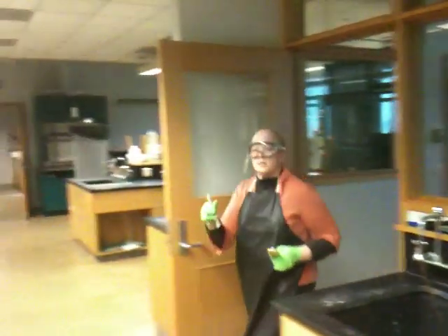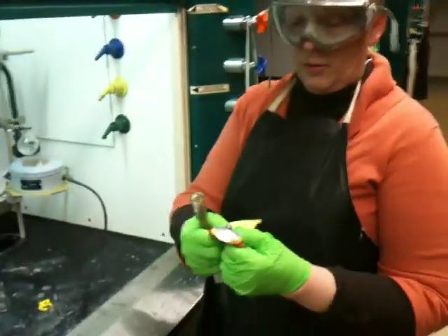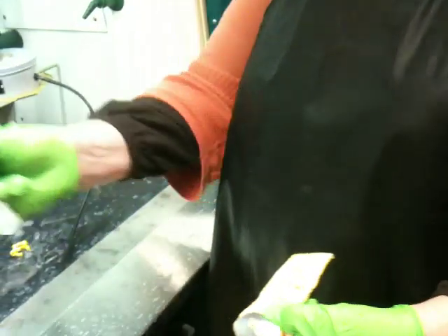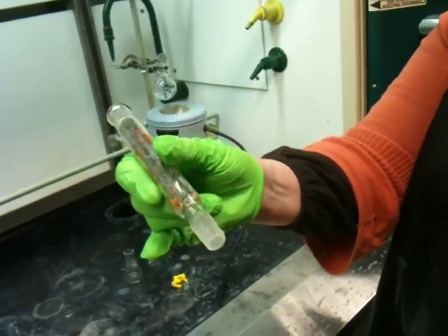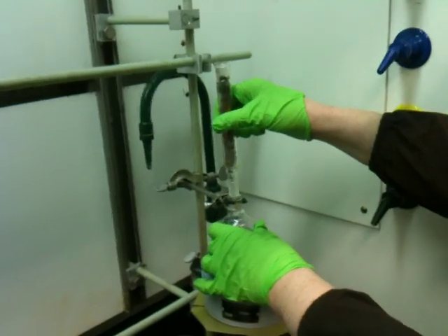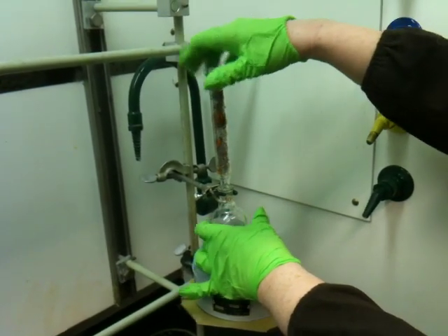This is a distilling column. If you want to grease a joint, all you have to do is put a little tiny bit of grease on the joint you're inserting, place it inside the round bottom, and spin it around a little bit. When you do that, it'll grease up and seal the joint.